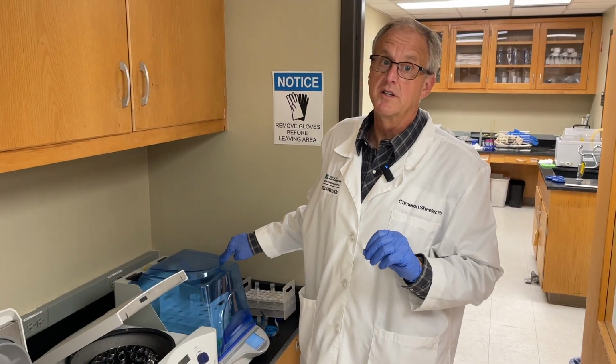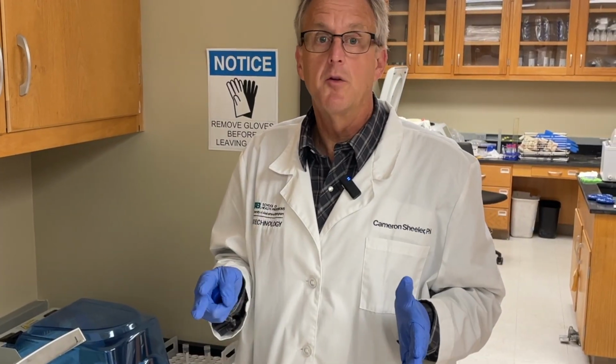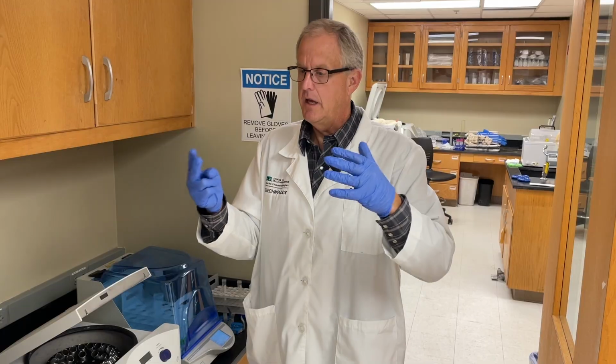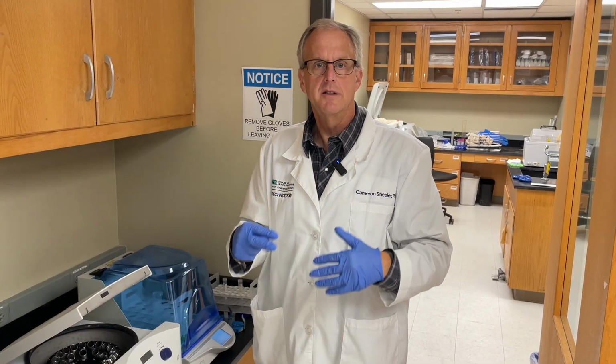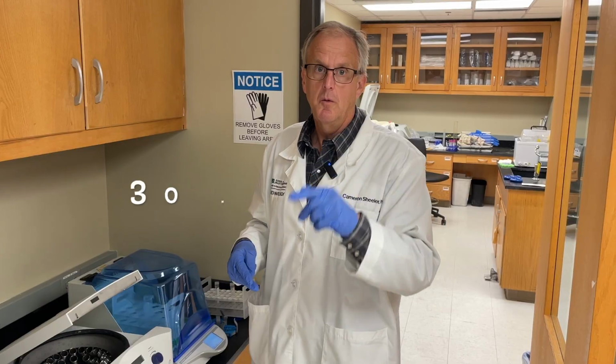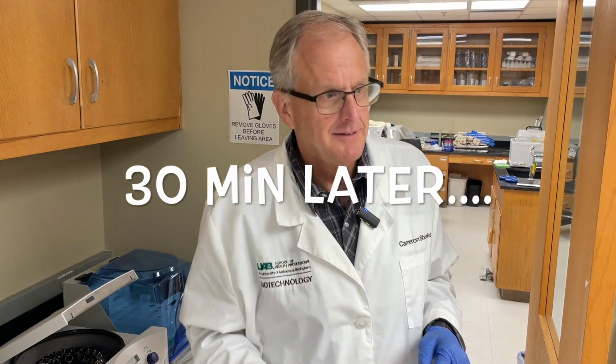This is the recovery stage. The bacteria has been through a traumatic experience with that 42 degrees Celsius. Now, we're going to let it recover. It's this rich media. It's going to help start making its antibiotic resistance. It'll help start making the proteins, anything it has to do to recover and start growing. We'll be back in 30 minutes.